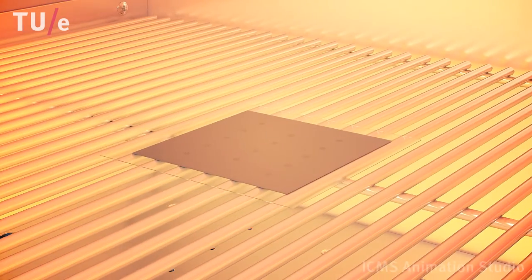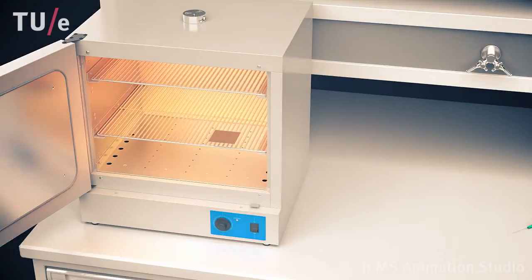The substrate is placed in an oven to cure the polymer so it becomes elastic.